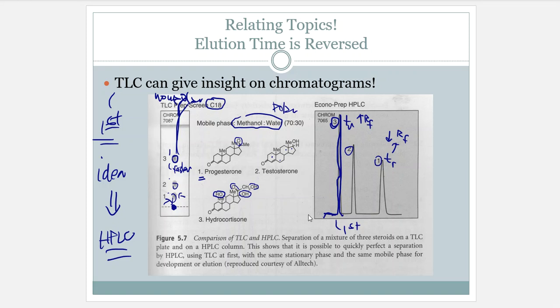All right, guys, in the last video, we talked about how TLC can relate to HPLC as far as method development goes. So if we want to process a lot of samples at one time to see how they're going to interact on a stationary phase and mobile phase, TLC might be an appropriate way for that, especially if I'm trying to create some type of situation where I'm picking a proper mobile phase, I'm picking a proper stationary phase in order for this separation to take place.